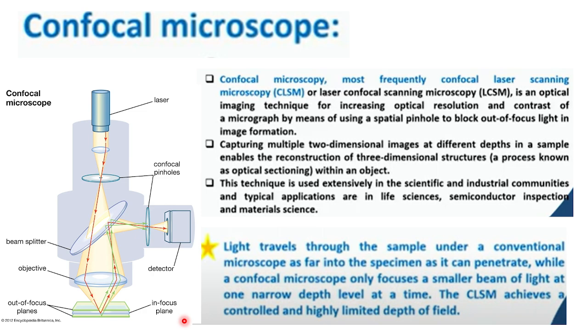Obviously in the case of transmitting, the light is penetrating through the object. Now in the case of scanning, what we actually do is, we have a region of interest, ROI, and through each point I am making the interaction and getting the data from each point. In that way it is scanned.